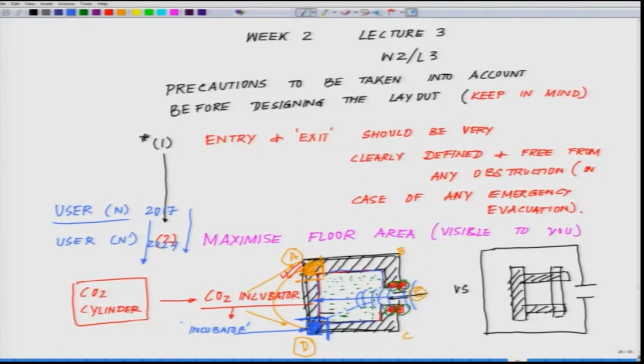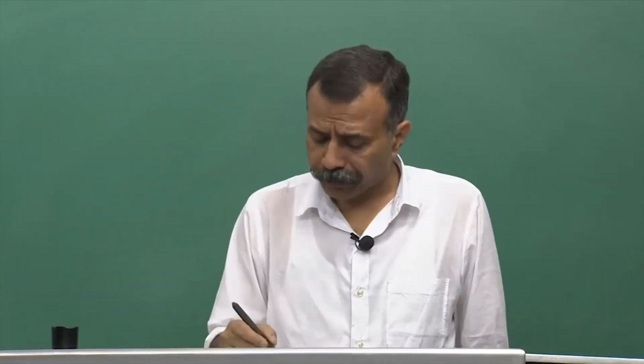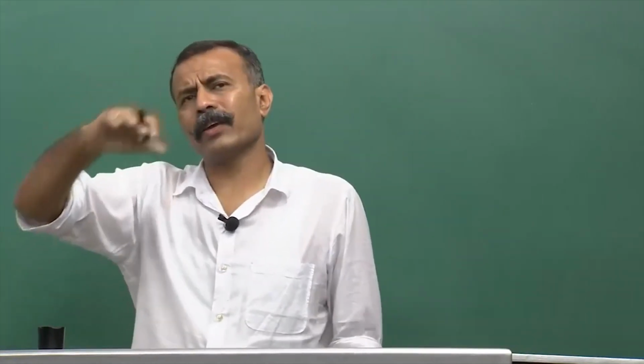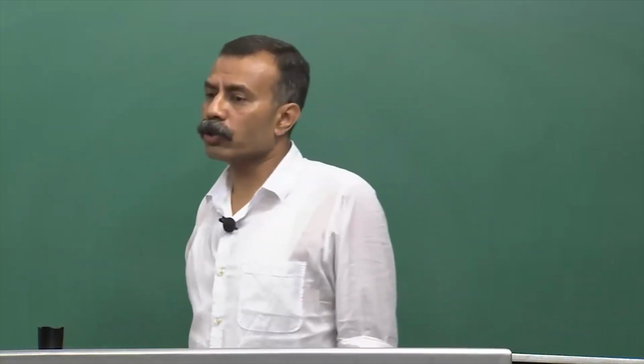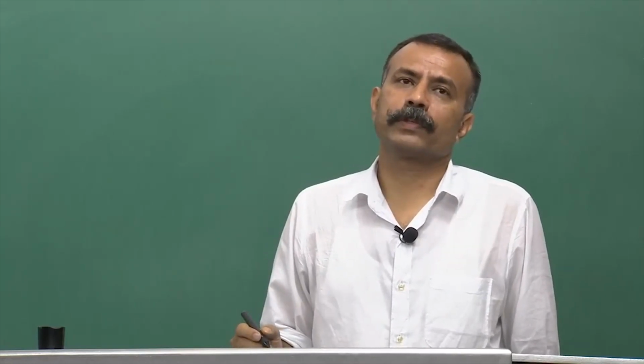Based on that, you have to assign in these incubators who will be using how many shelves, because these are costly. When you are getting a CO2 incubator, it costs a fortune. For a new PI or a new faculty who is starting, it's always a challenge. So you should have a very clear idea that these shelves are designated. But then on top of that comes who will be using what kind of stuff.